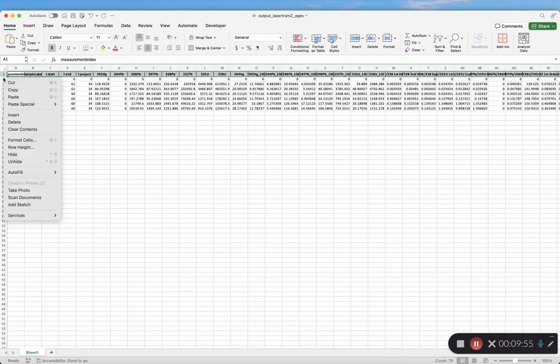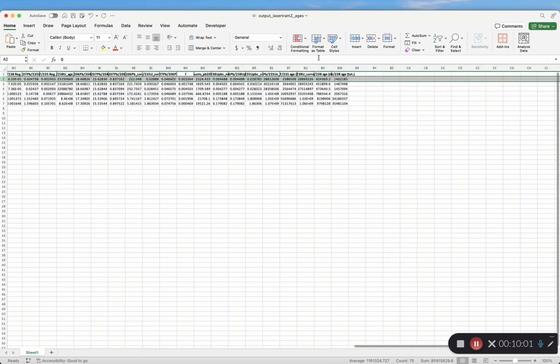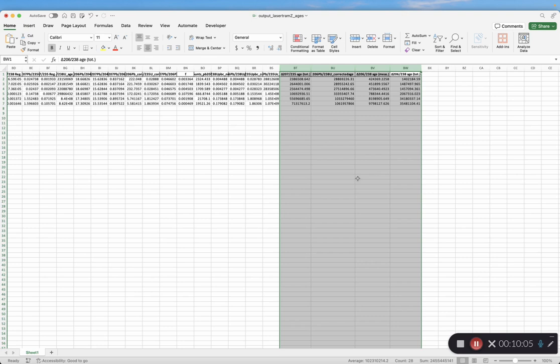So we're going to delete that guy. And here is that data. All right. And that wraps this up.